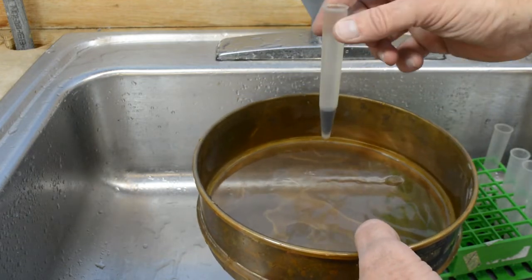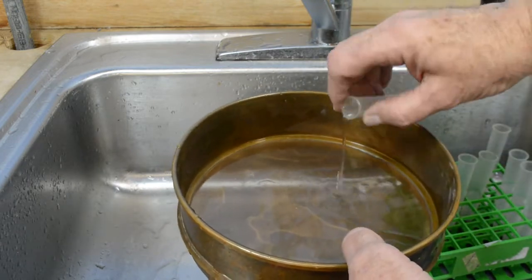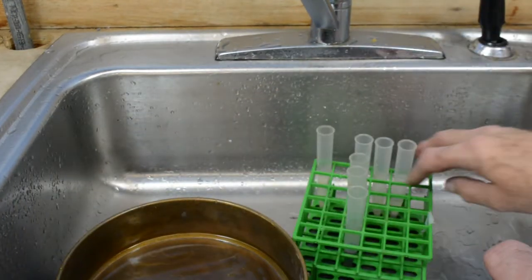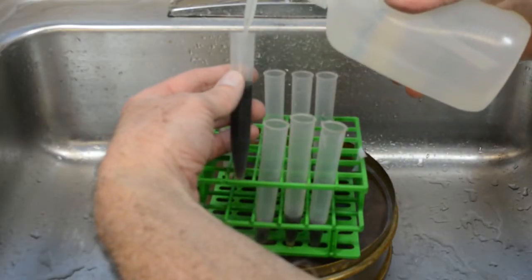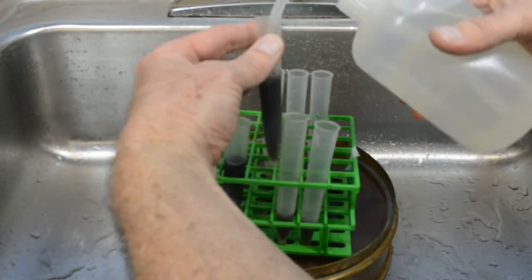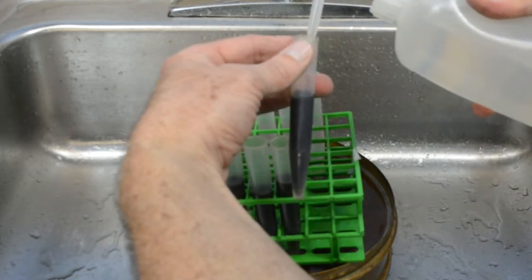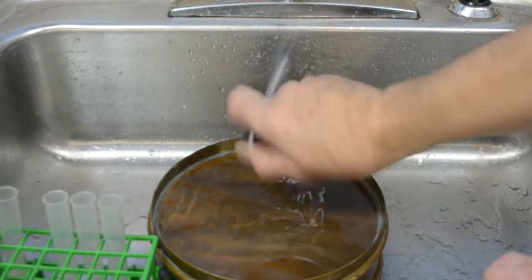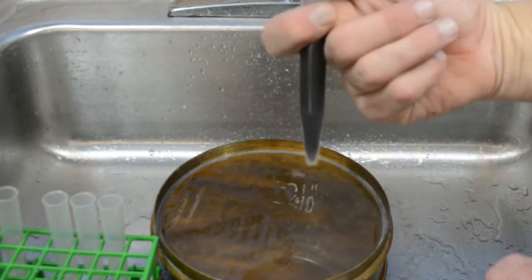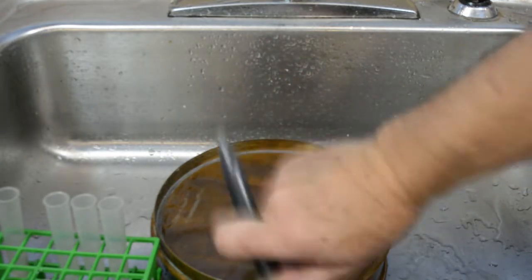We take the tubes and discard the liquid from the top. Since water has a density of 1 gram per ml, all of the soil particles and biologics will be in the bottom of the tube. Next, we take a sugar solution containing 454 grams of sugar per liter and squirt it into the tubes. Mix the tubes to make sure all of the soil is suspended. The density of the sugar solution is approximately 1.18 grams per ml, which will allow the biological material to float, but not the soil particles.